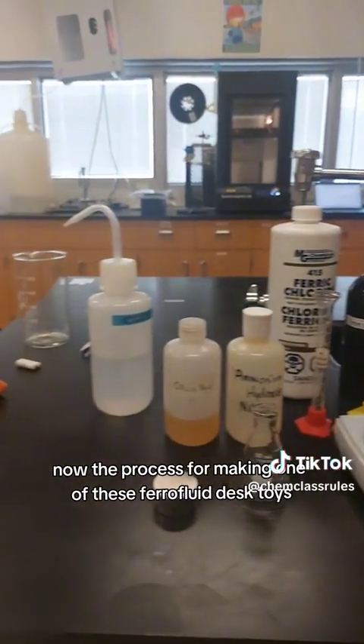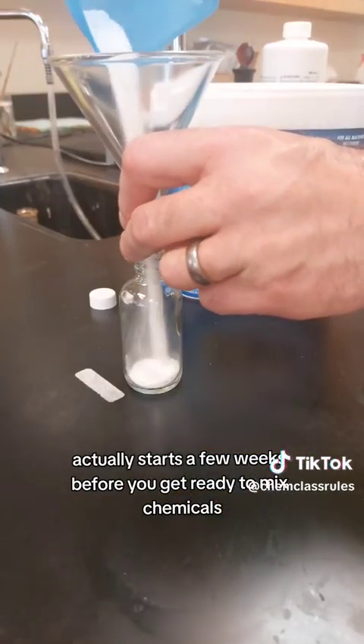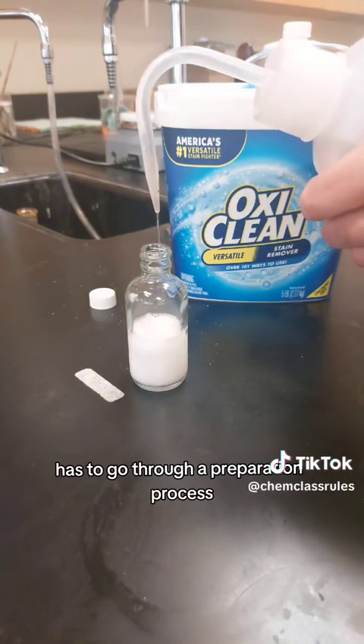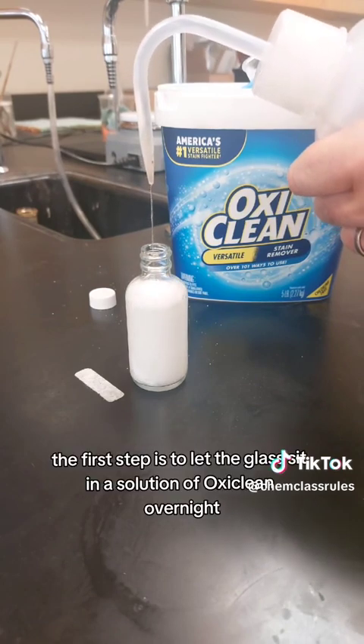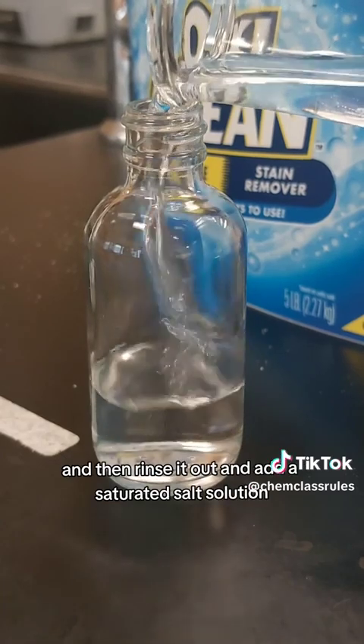The process for making one of these ferrofluid desk toys actually starts a few weeks before you get ready to mix chemicals. That's because the glass that you use has to go through a preparation process. The first step is to let the glass sit in a solution of oxyclean overnight and then rinse it out.